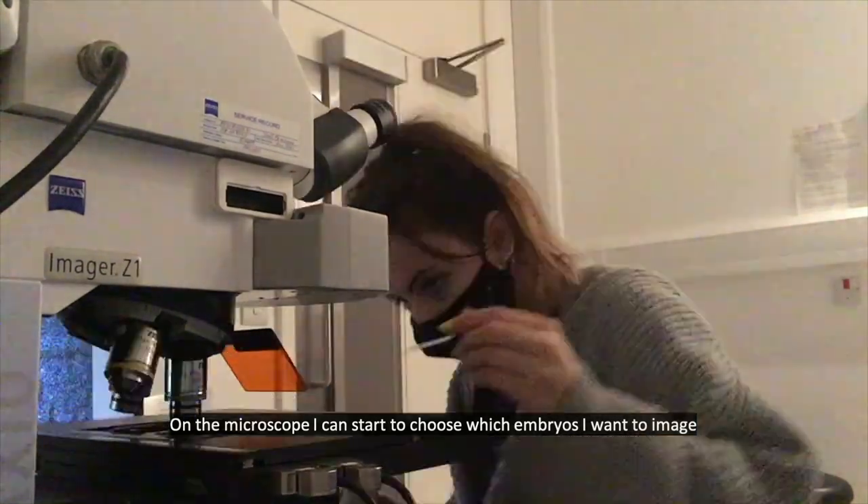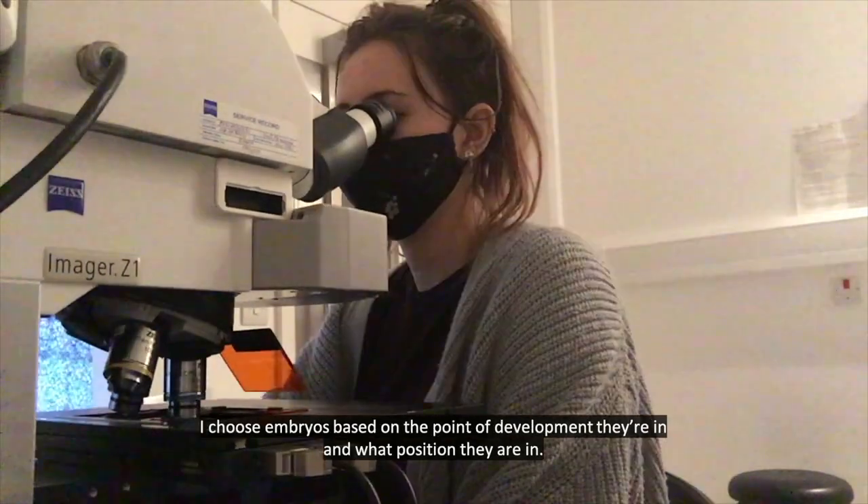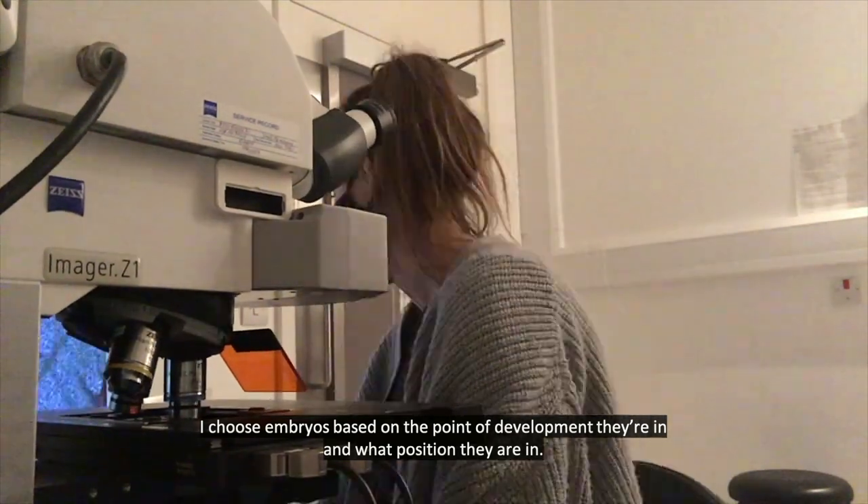On the microscope I can start to choose which embryos I want to image. I choose embryos based on the point of development they're in and what position they're in.